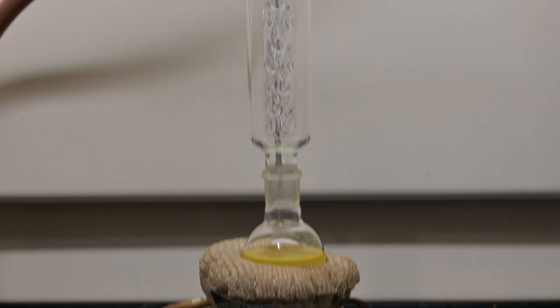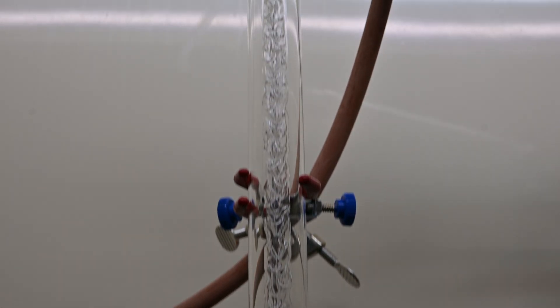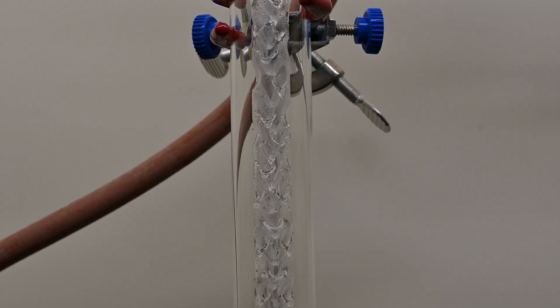The fractional distillation setup is quite similar to that of regular distillation, with a key difference being the inclusion of a fractional column. There are many types of fractional columns, such as bubbler plates, packed columns, etc. Today we'll use a Vigreux column.